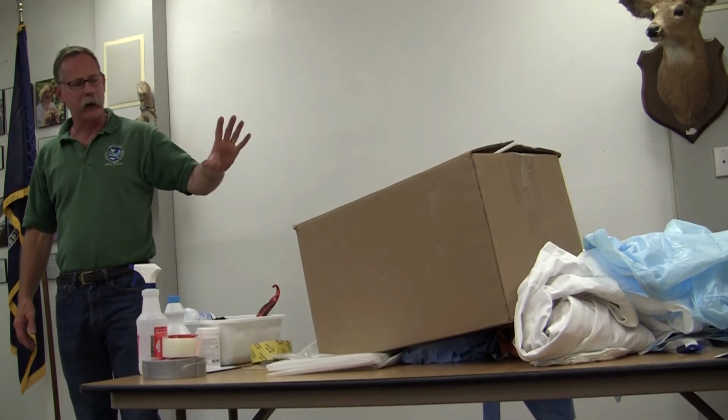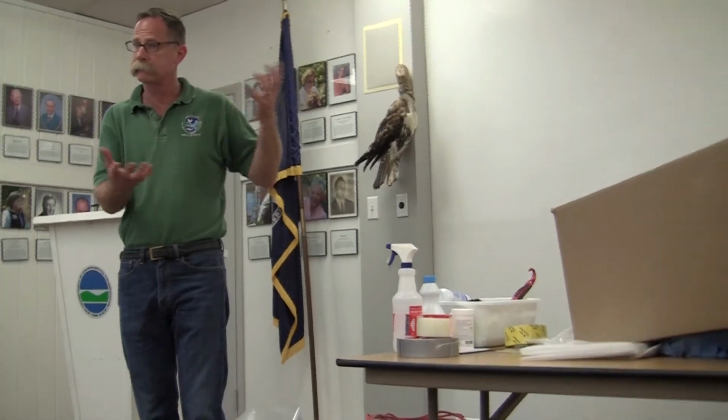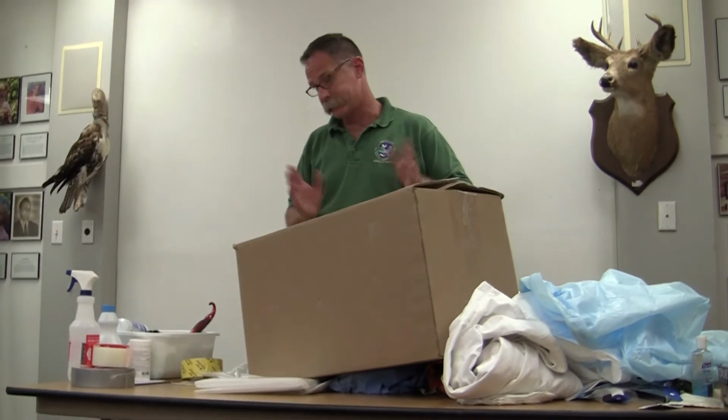The goals here are to make sure that the carcass arrives in as good condition as possible for us to look at to see if we can use it for diagnosis, and to make sure that nothing leaks out of there and freaks out the UPS guy. We had a really good UPS guy for the past couple of years, but he's moved on, and the new guy is not so good.